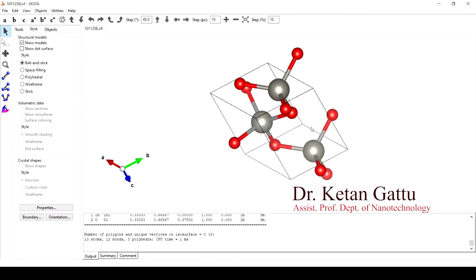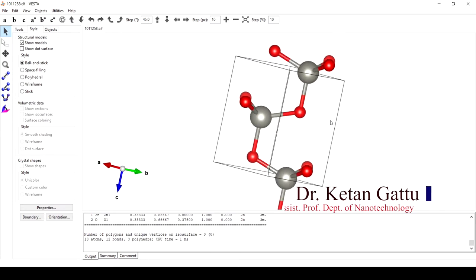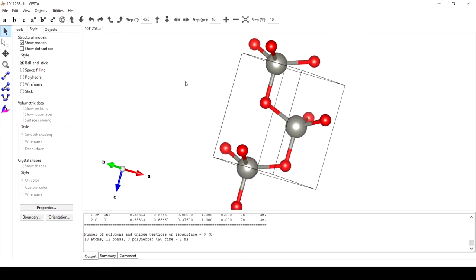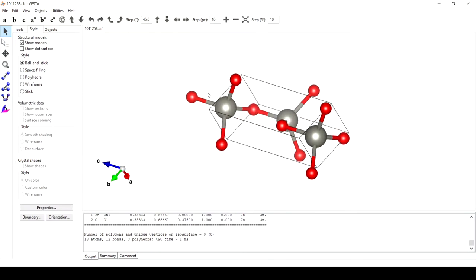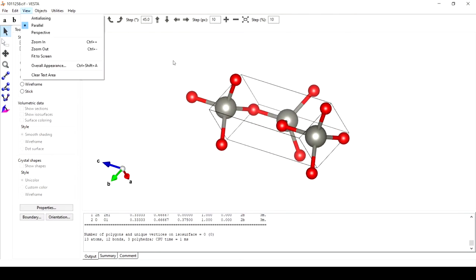Once we import this, we have a unit cell here. Now we can build a supercell out of this. Suppose we wish to build a 2x2x2 supercell.